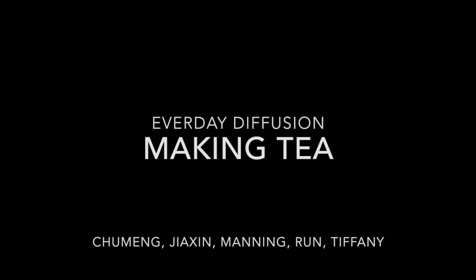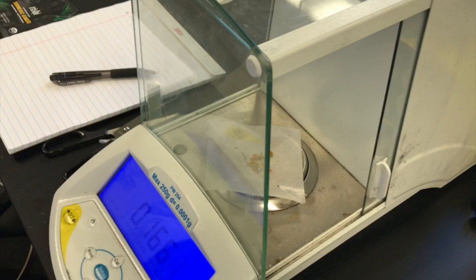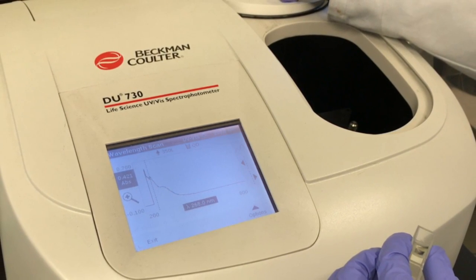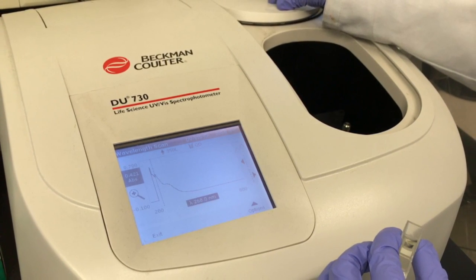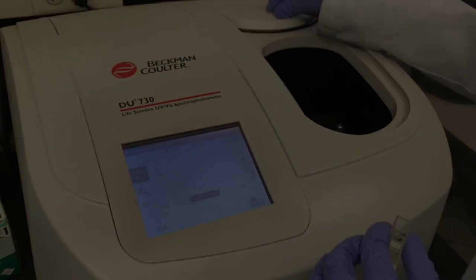Hi ladies and gentlemen, today we are going to show you how mass transfer is involved in a very simple everyday process, making tea. We will be preparing tea with water at 3 different temperatures with the same amount of tea leaves. After letting them soak for a minute, we will analyze these samples in a UV-vis spectrophotometer to determine the difference in concentration of the solution and correlate this with diffusion rates.